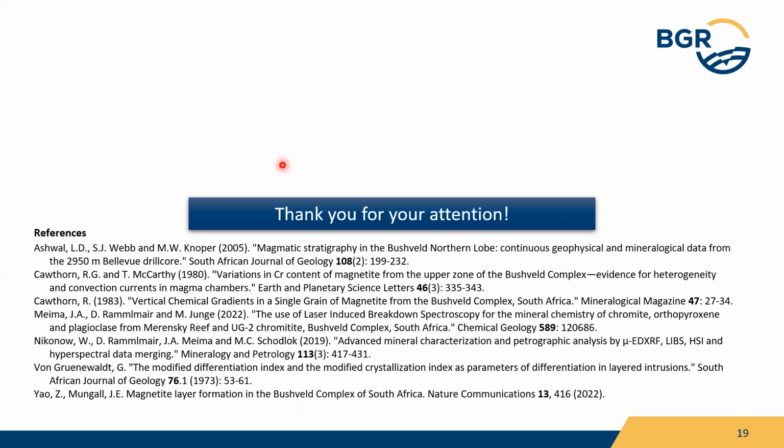One question. Yeah, very interesting. So I don't know if I might have zoned out somewhere in there, but I presume from the textural information you've got there, you could do crystal size distribution information, grain alignment, yes, groupings. If you can do dihedral angles, we could just chuck our microscopes away. I think this is an ideal, potentially very powerful way to check the 2D information that we have there. Yeah. Thank you.